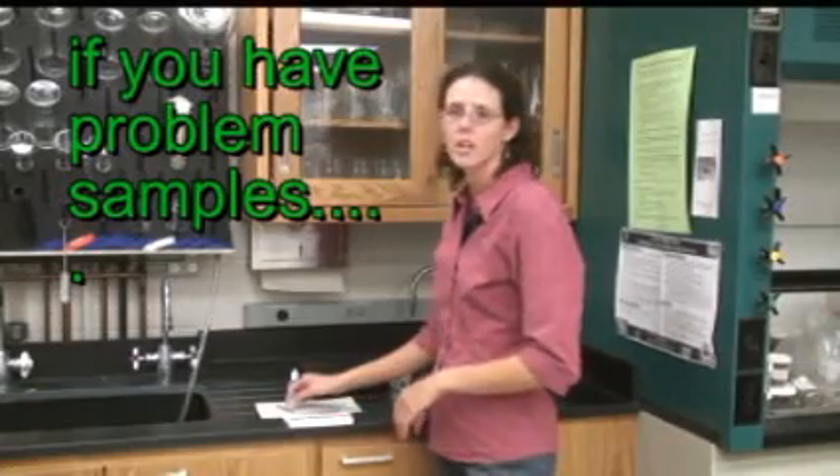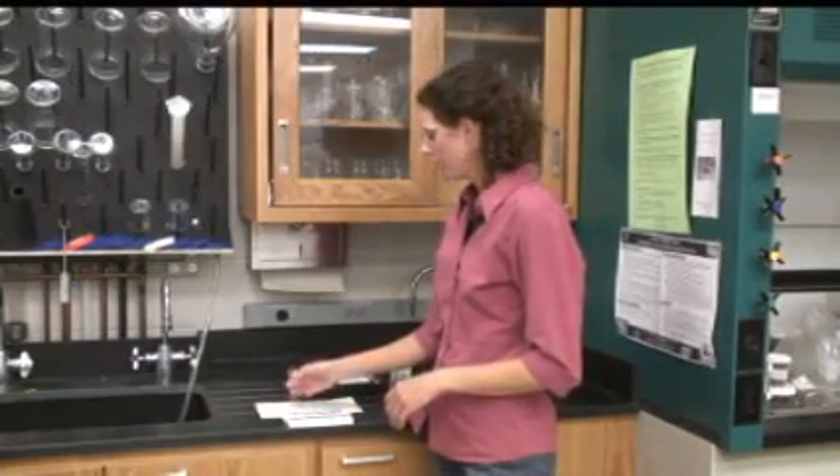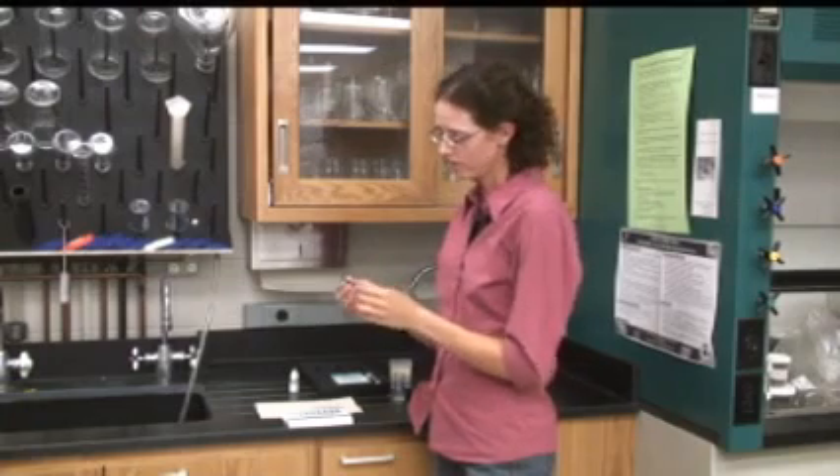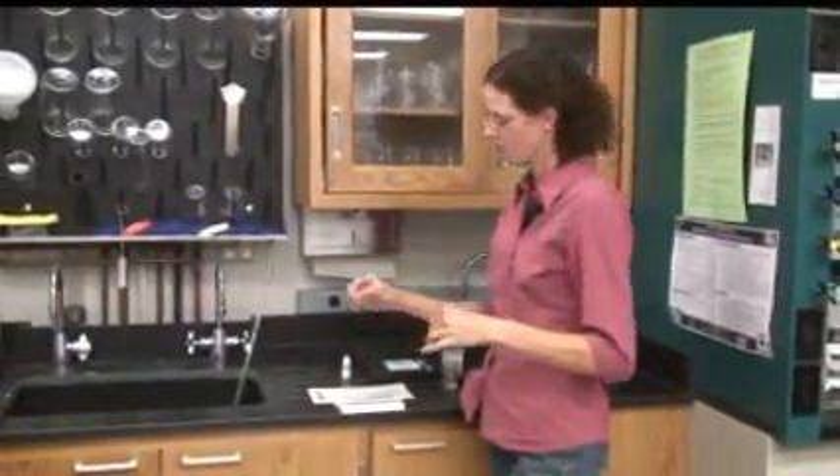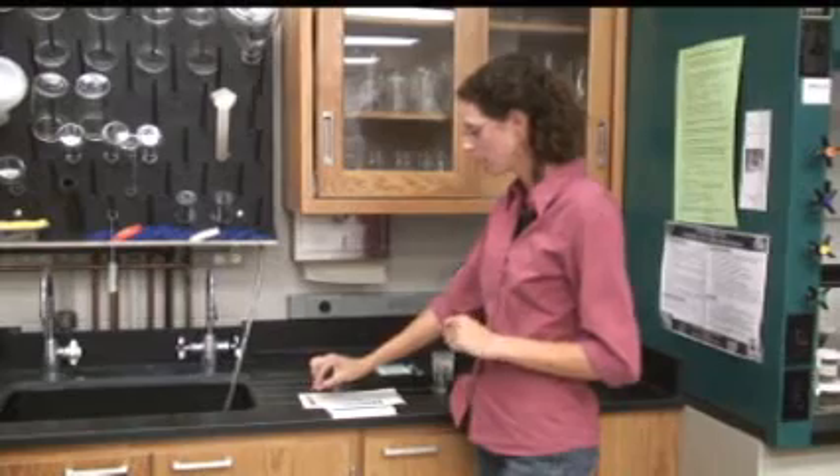If there's a lot of sediment in your sample, your tube can be an off color, like a dark gray or brown. In that case, you can either filter your sample before running the test, or set the tube on its side overnight and let the sediment settle to the bottom of the tube and then read it.